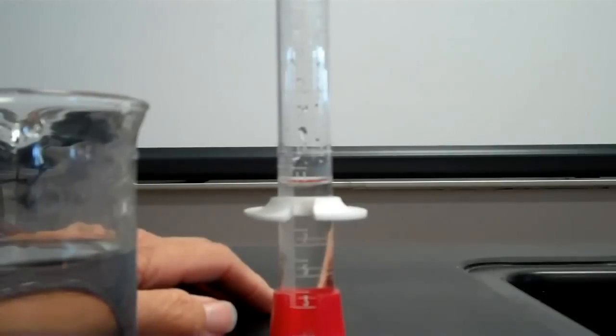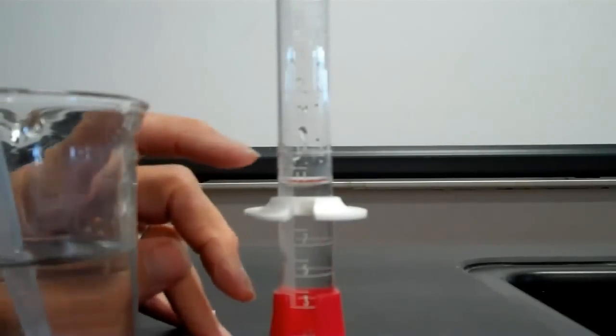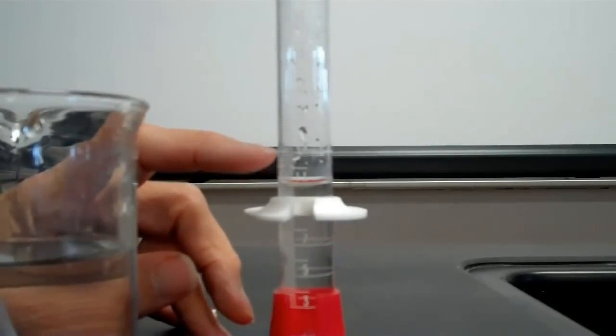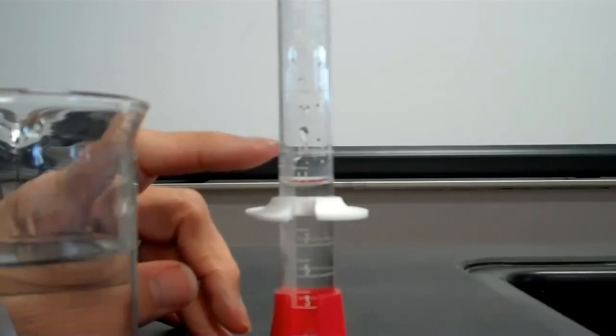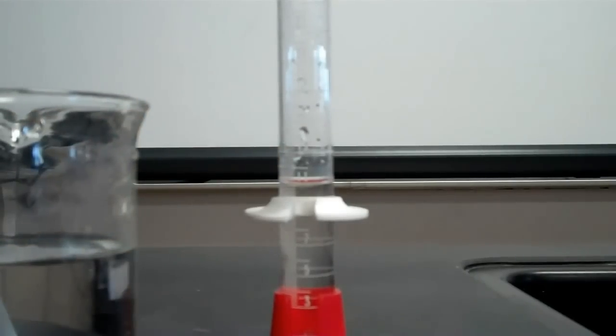And then I'm going to do the exact same thing again. I'm going to count how many drops it takes to get to 12. And then I'm going to count how many drops it takes to get to 13. And then once I've done that, I'm going to find an average.